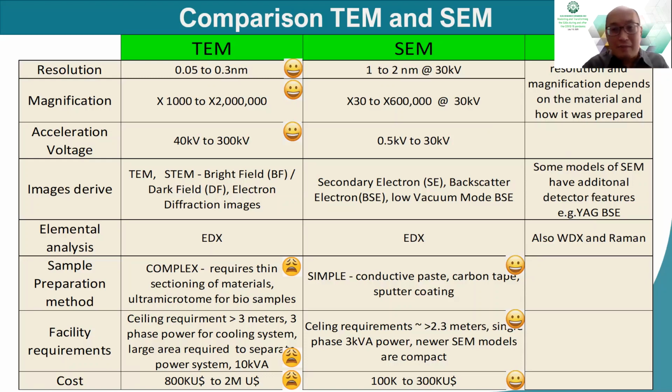And this TEM is a very tall instrument, requiring a ceiling of more than 3 meters. You have to have a room with a high ceiling and a three-phase power system for its cooling, because you have to cool down the electromagnetic lens, which uses a lot of current. Right now, for SEM, there are a lot of models.